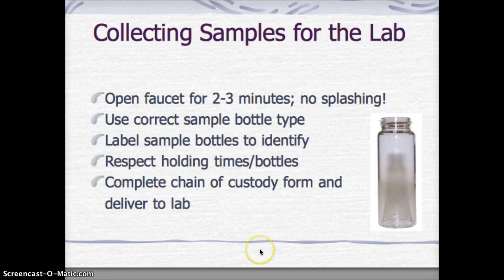Now, collecting samples for the lab. And this is really just an overview, and you will see in the videos that you will view for this lesson, there are some great AWWA videos that show, I think, most of what we're going to look at in the next couple of slides. So, to collect samples, you would open the faucet for 2 to 3 minutes with no splashing, and make sure you have the correct sample bottle type.